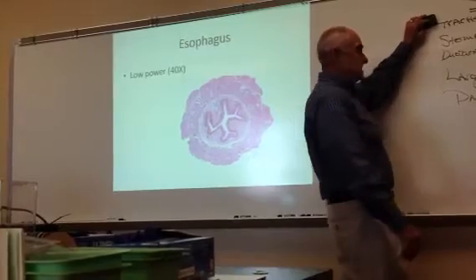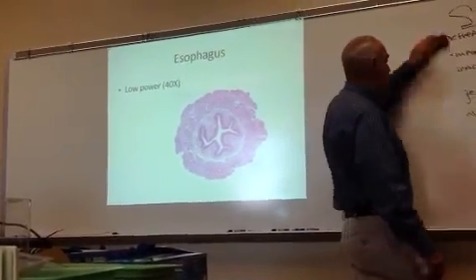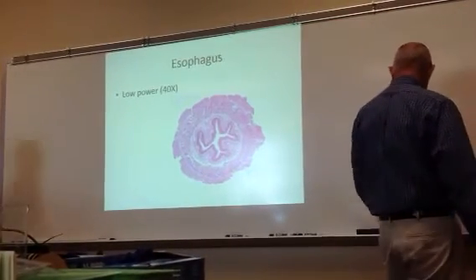Now, of these slides, has everybody got one of all these slides? Hopefully, if you don't find one, you can share with somebody else. I think we usually have enough for everybody.